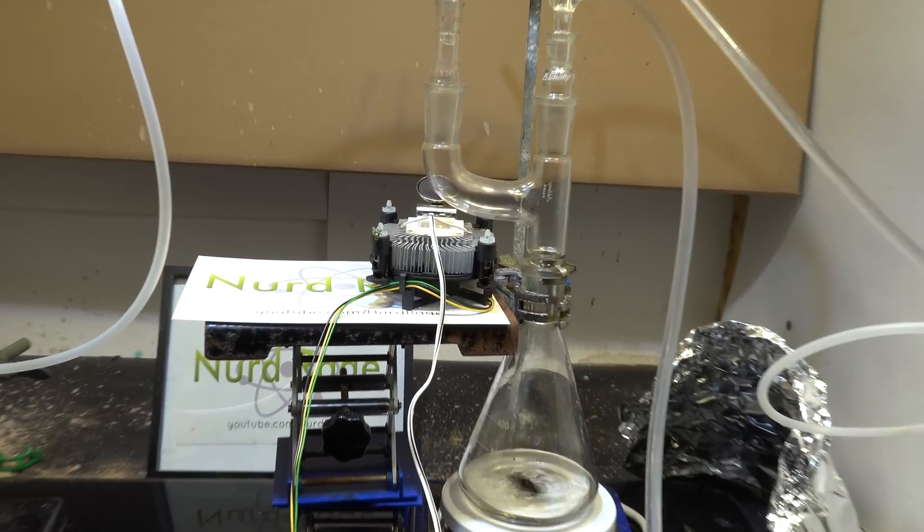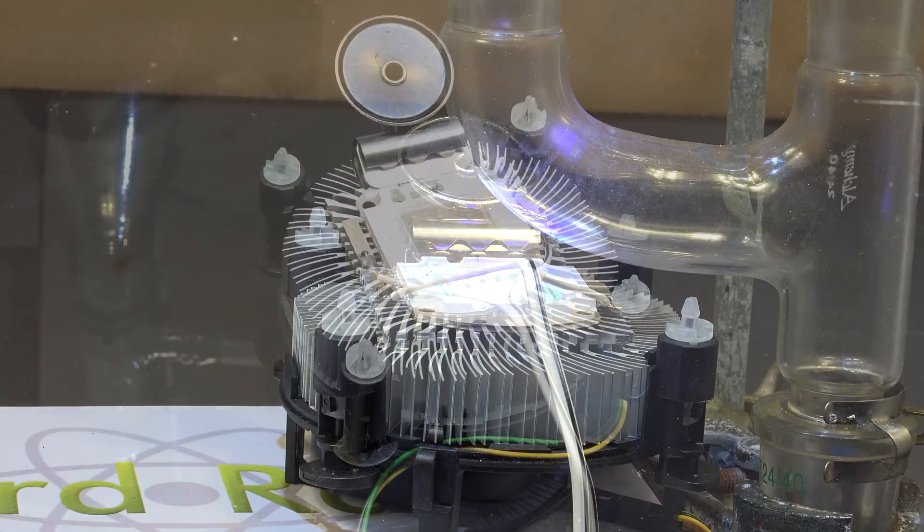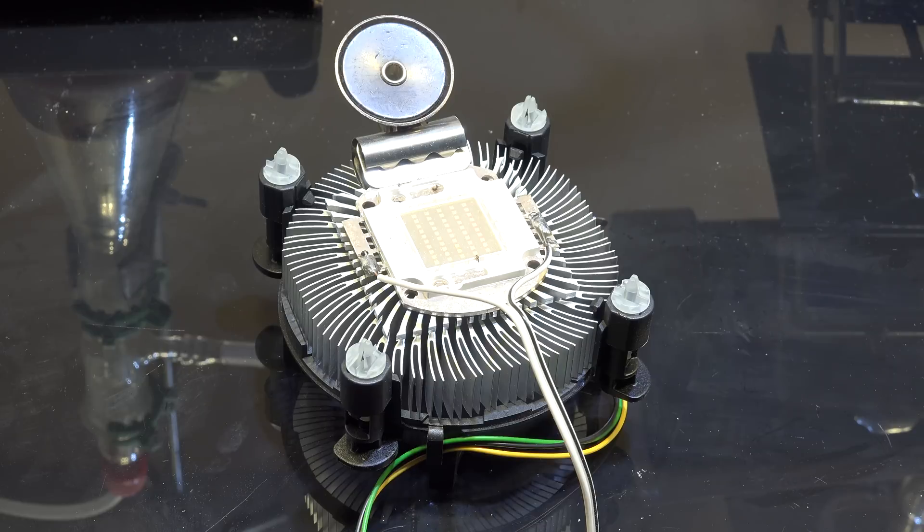Once the two gases are mixed, the fun part happens over here when it passes over the ultraviolet light emitting diode chip, or UV LED chip. These LEDs are pretty easy to get online and I'm using a 50 watt version that I've clipped to this spare Intel CPU heatsink. It's being powered by a power supply off camera. The wavelength is about 400 nanometers.